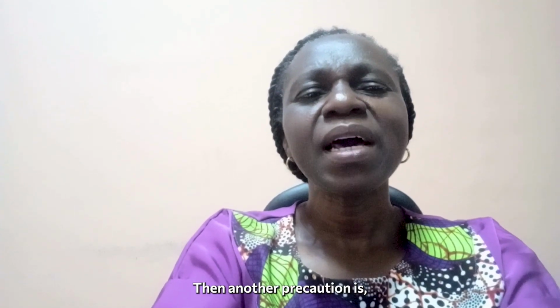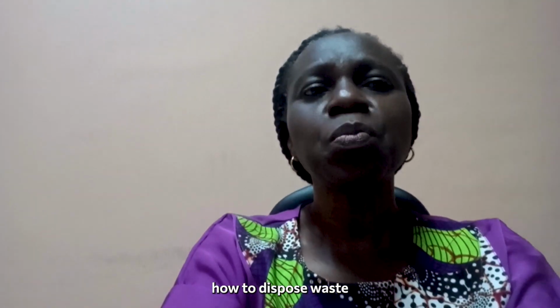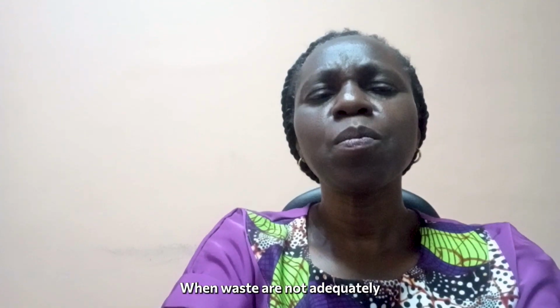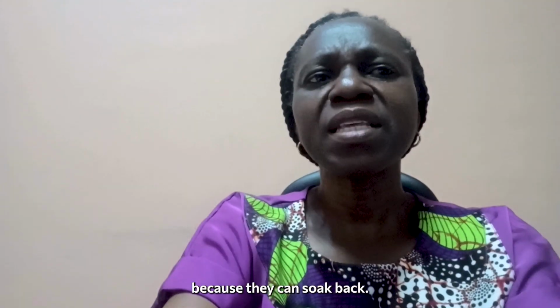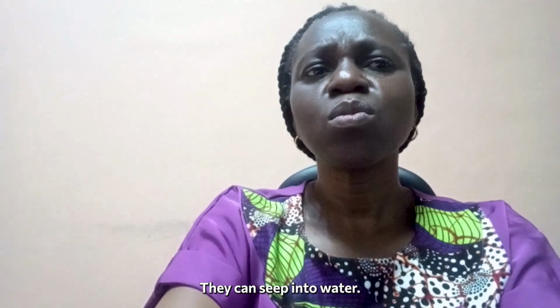Then another precaution is how to dispose of waste in the laboratory. Waste disposal is very important. When waste is not adequately disposed of, it can pose a threat to life because it can seep back into water pipes.